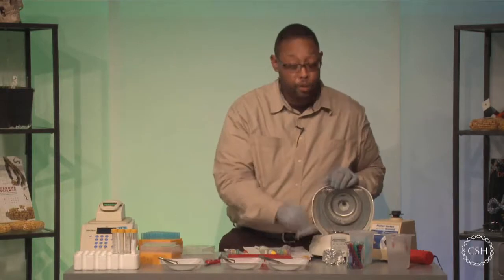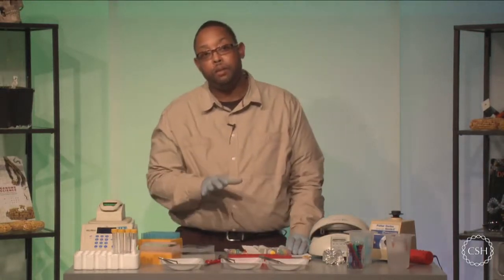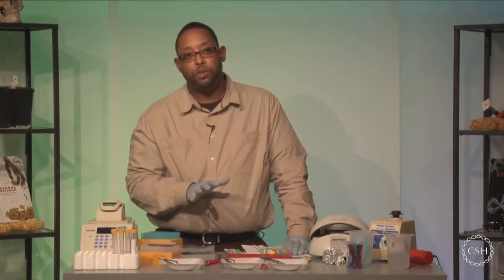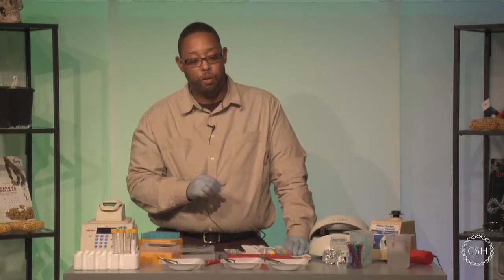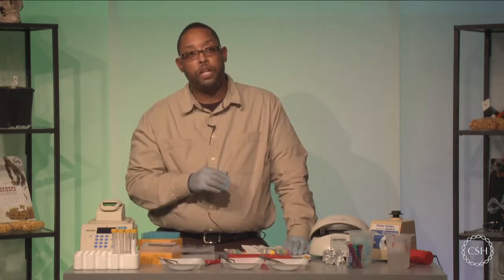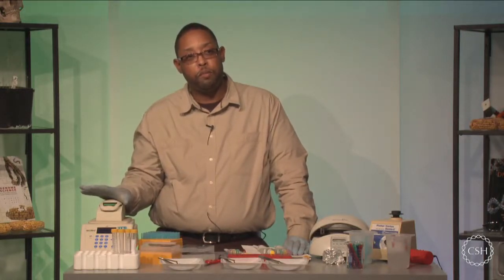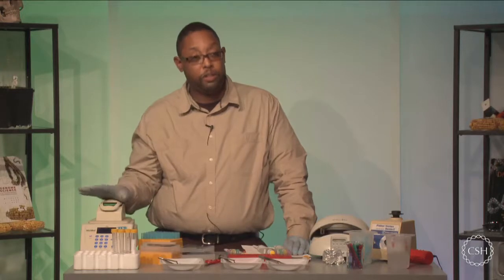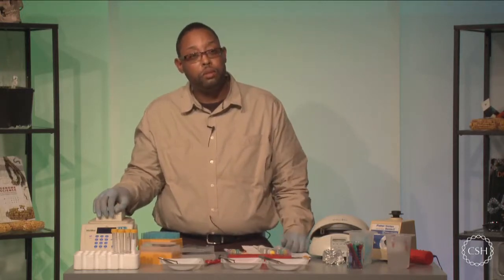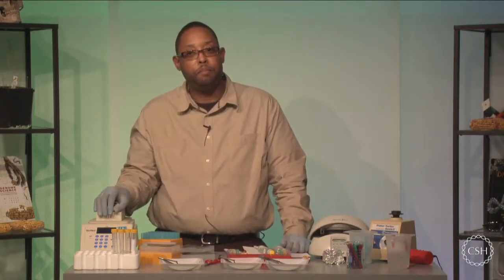That essentially concludes the silica DNA isolation, in which you have your DNA now soluble in water, okay? You can freeze this down at minus 20, and it will stay stable relatively long, but I do recommend with fresh samples going straight to the PCR amplification so that you can get your PCR product, confirm it on a gel or some other matrix, and then move on to sequencing after confirmation of a PCR product. But this actually concludes the silica DNA isolation. And if you have any questions, I'll happily field them at this time.